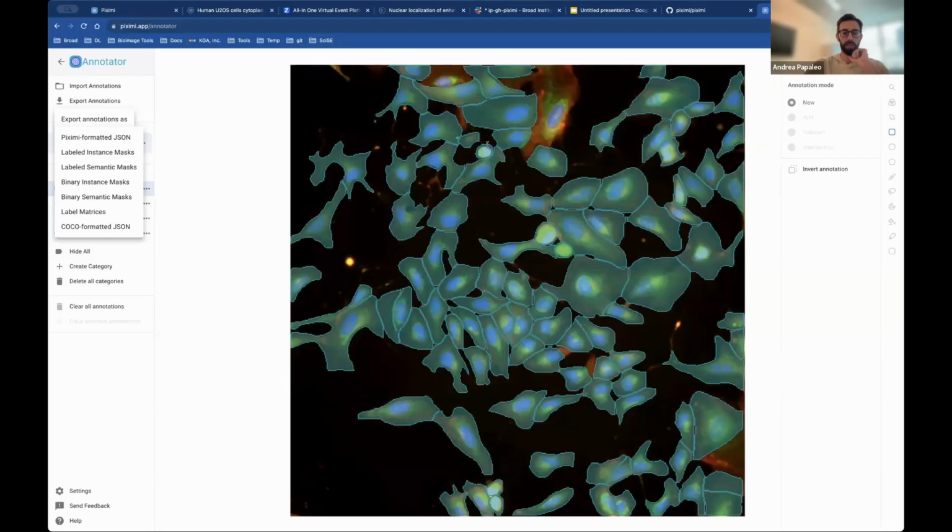To extend the interfacing to BioEngine. Yeah, currently we would like to be able to use any model that's currently being hosted and running on BioEngine, providing that it has the pre and post processing there. One challenge with that is knowing what the structure of the output is going to look like in order for us to be able to display the annotations and work with the annotations.